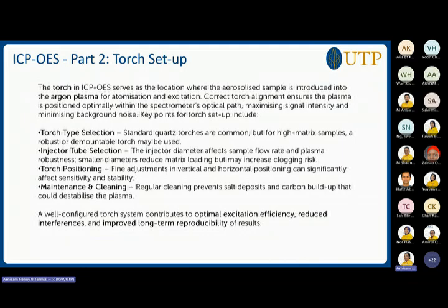Torch positioning: fine adjustment of the vertical and horizontal positioning significantly affects the sensitivity and the stability. Maintenance and cleaning: regular cleaning prevents salt deposits and carbon build-up that destabilize the plasma. A well-configured torch system contributes to optimal excitation, especially reducing interference and improving the long-term reproducibility of the results.